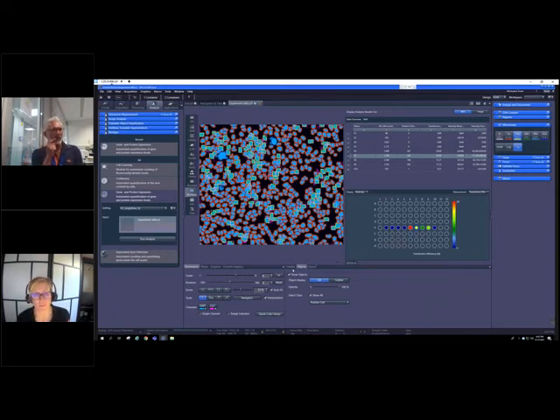Second, this is what Frank pointed out at the end: these LEDs, which are based in the beam path of the condenser, used for focusing. These two, or at least more than two, can be used for giving this very unique contrast we have seen at the very end of this overview image, which nearly looks like a DIC image or something.